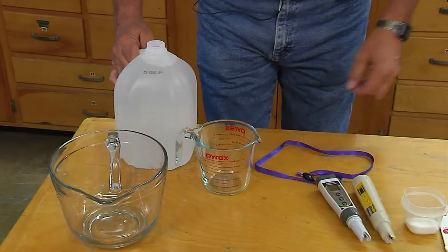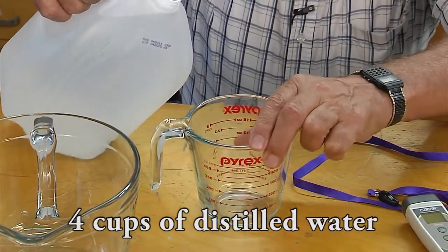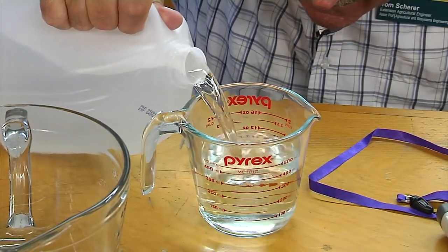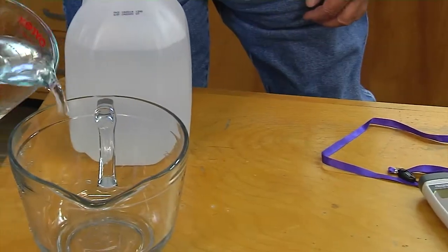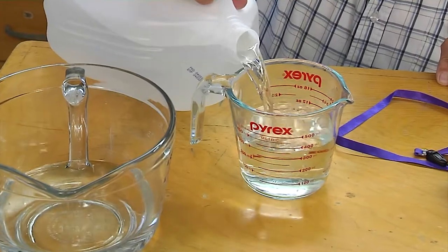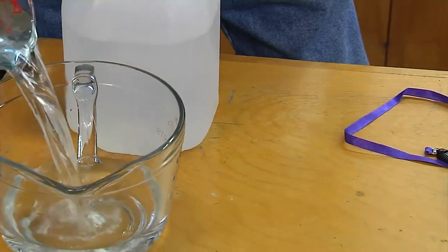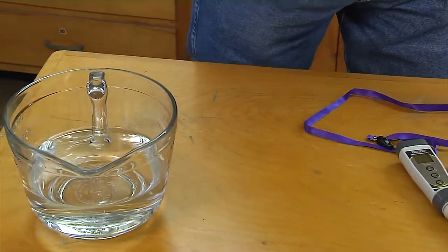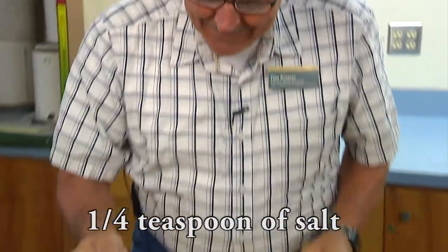First thing you want to do is measure out four cups of water to put in the bowl, and you want to do it accurately. I'm going to fill this up on a level surface — I can see I got just about exactly two cups, so I'm going to measure out another two cups. Now we've got four cups of distilled water, and to that we want to add one quarter teaspoon of salt. Level it off by shaking, then just dump it in.